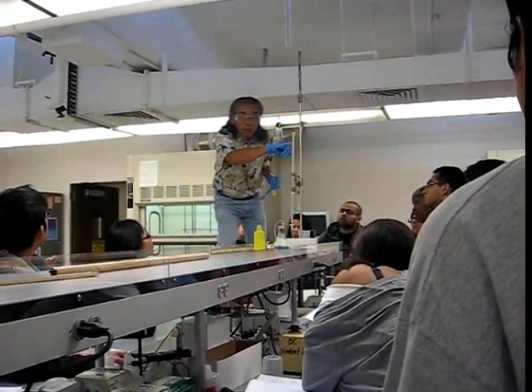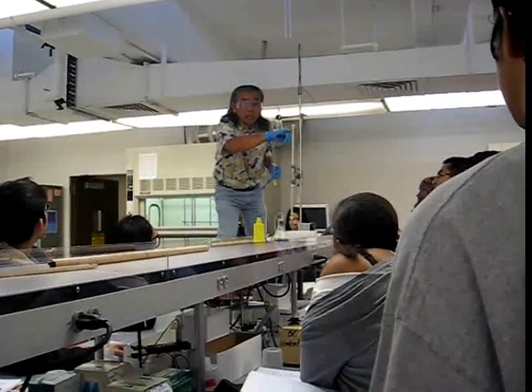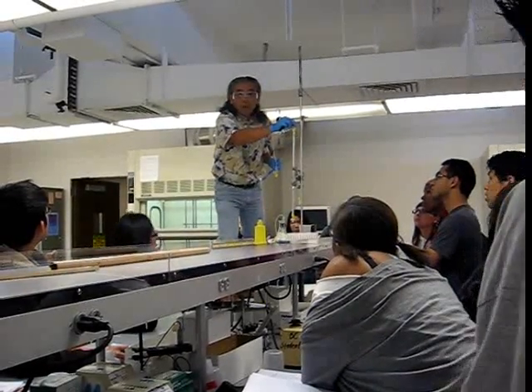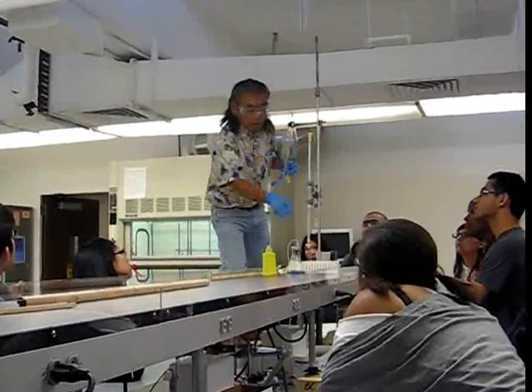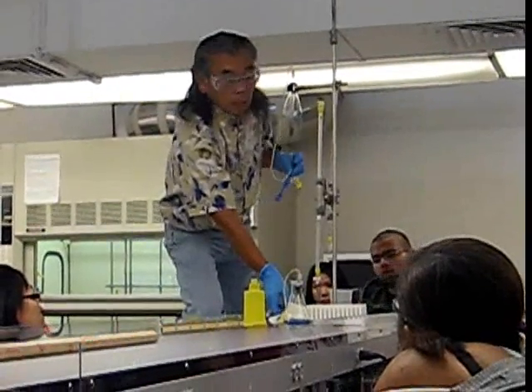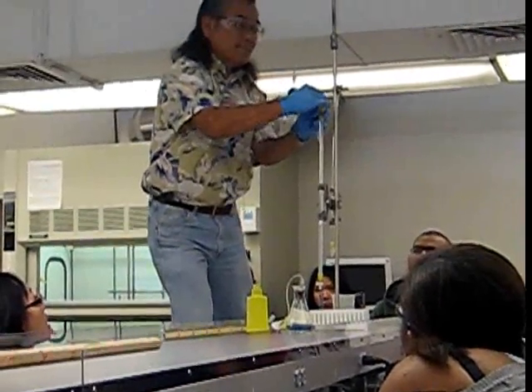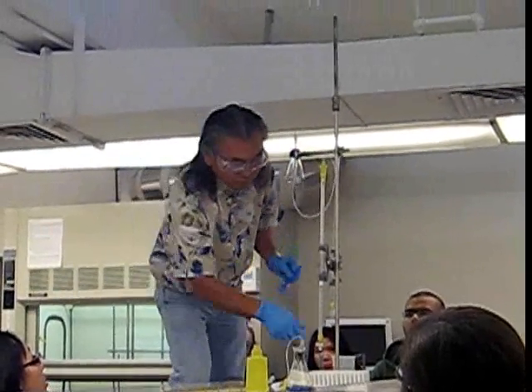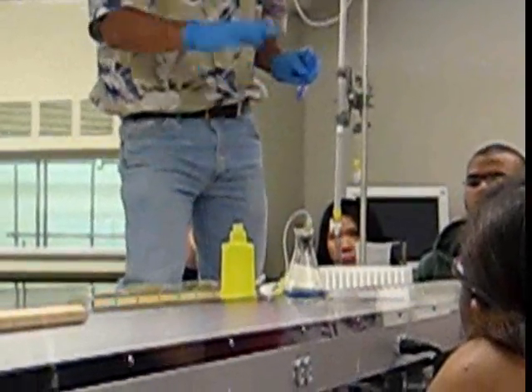Make sure that you have enough buffer up here. Once it's in here, when you start adding buffers, it's not going to mix it up. Add it up to here, clamp this off. You may get a ml or you may get two. Put this back on tightly, open this back up, and start collecting one of our fractions.